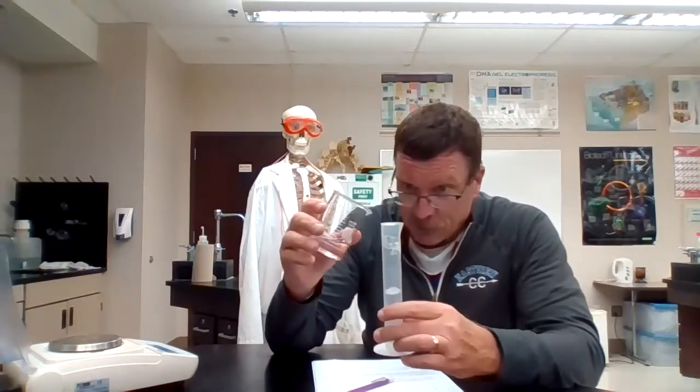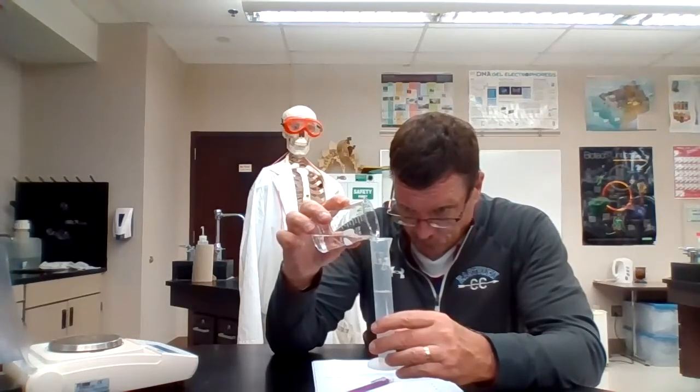Let's go this way. We're up to 40. 40 milliliters has a mass of 52.55 grams.